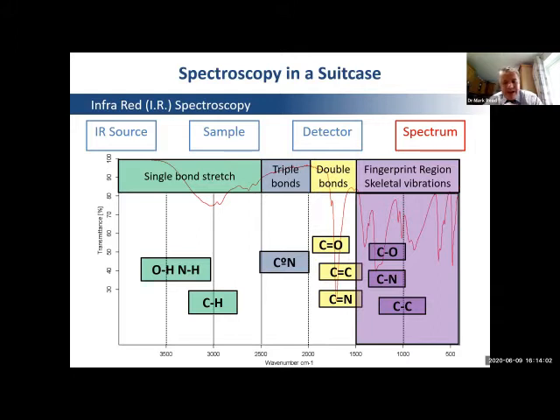Several of those peaks may be in the lookup table, but in general, we can't identify those. And you'll see why later when we look at some vibrational modes of these molecules. So this area is called the fingerprint region. And for A-level interpretation, we don't normally go into this region.